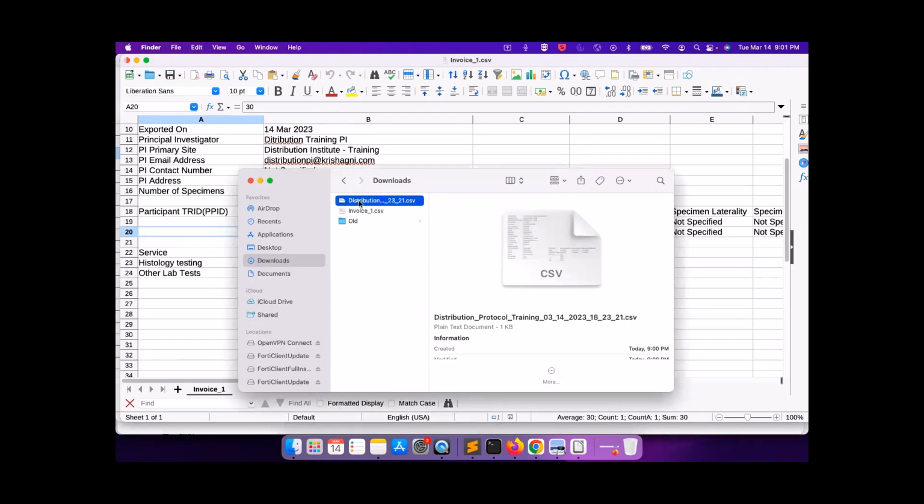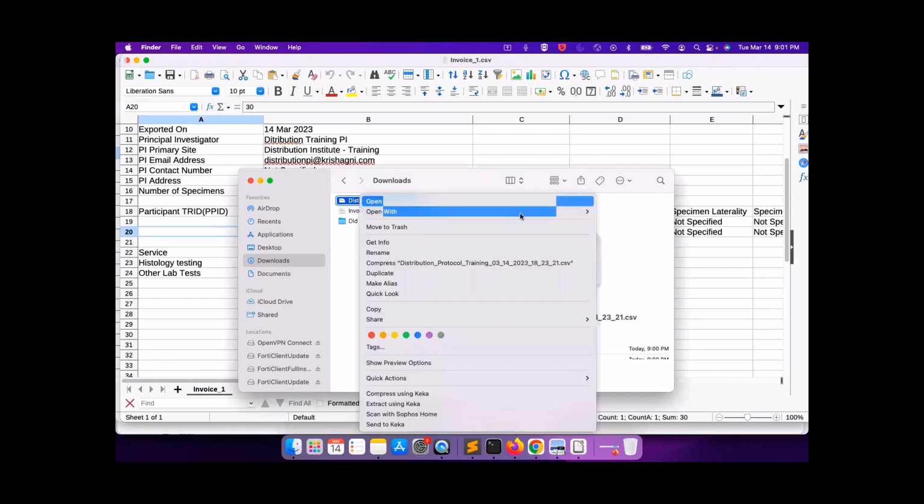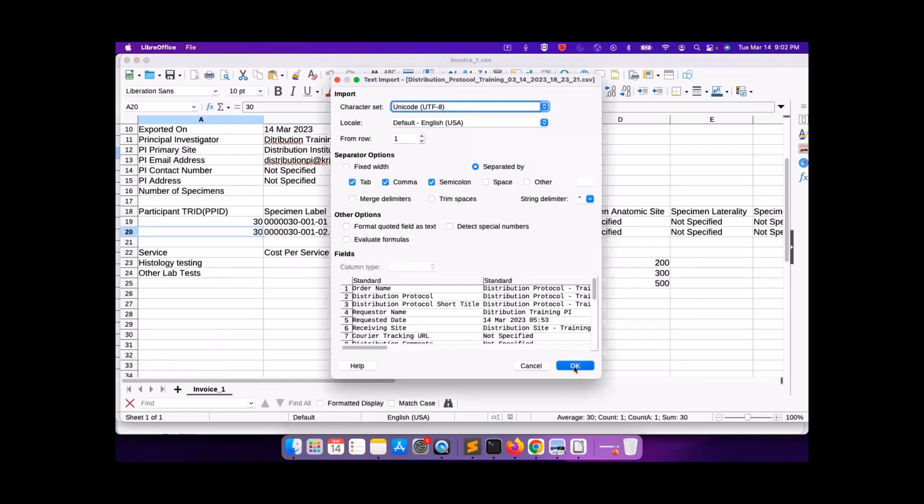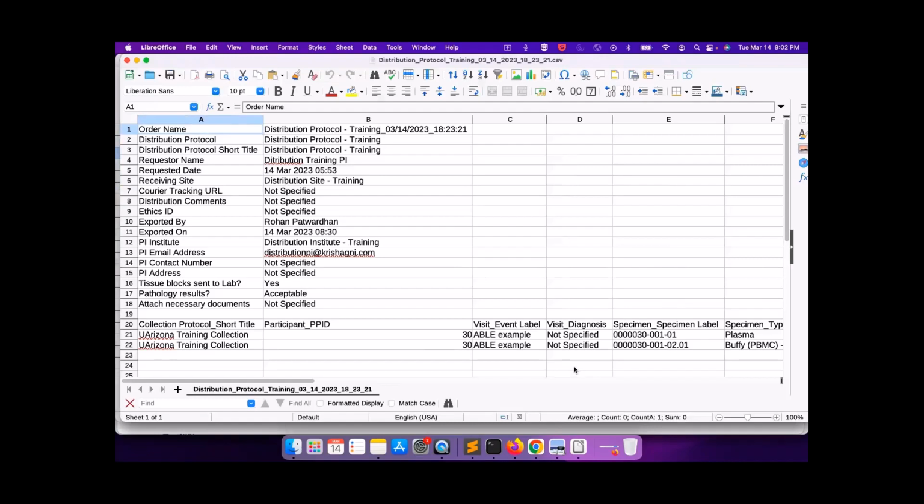And additionally, there is a distribution report. So I will also show that. The details of how to configure these reports, what fields are editable, what are not, what kind of information is configurable, all such things we will cover in the reporting module.